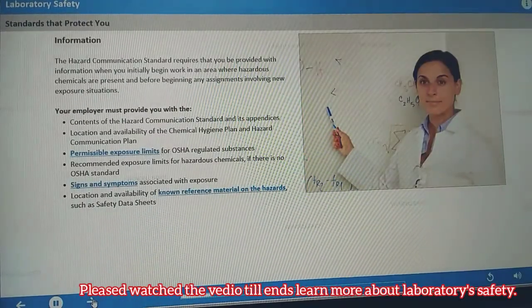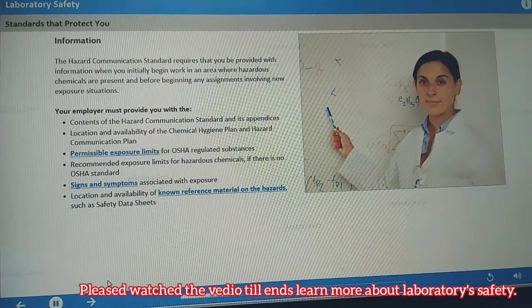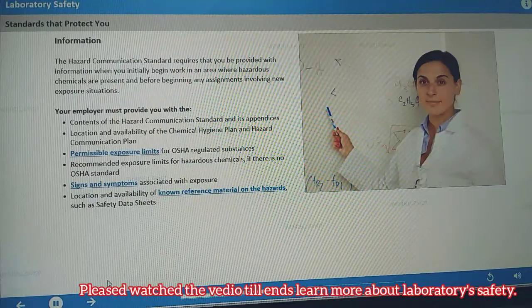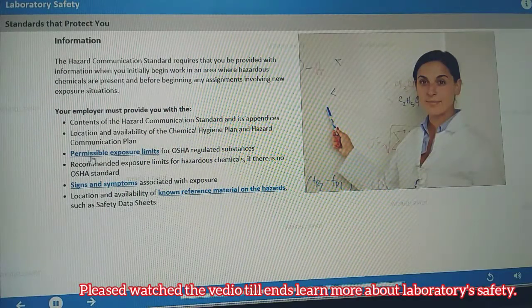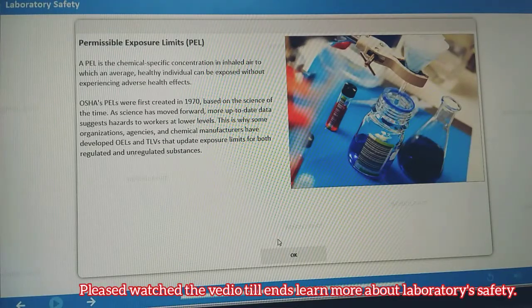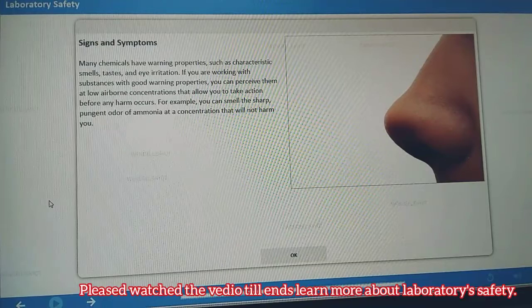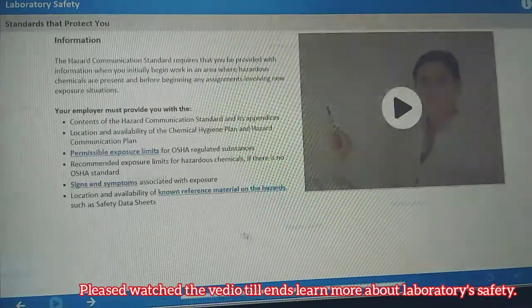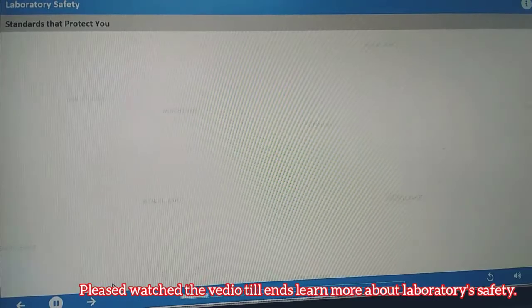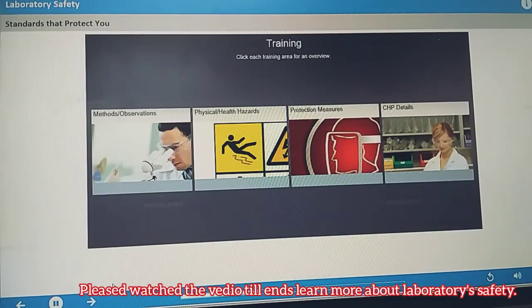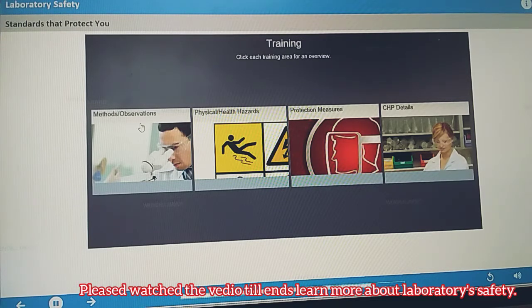The standard requires that you be provided with information when you initially begin work in an area where hazardous chemicals are present and before beginning any assignments involving new exposure situations. Your employer must make available any and all information that allows you to safely handle hazardous chemicals, including the frequency of refresher training.